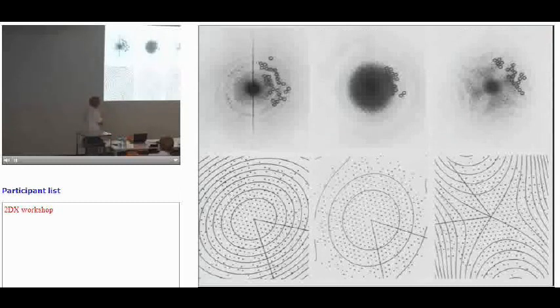These were the first 3 images of purple membrane that we got about 1985. This one was the only image we got from the EMBL. Jean Le Paul had a Zeiss microscope with a Siemens liquid helium lens on it. It was very unstable, and it would go wrong every hour and so on. And we gave up correcting the astigmatism because it was so annoying. So as a result, we have this beautiful image that goes out to 3.5 angstroms, but it happens to be more or less in focus with several thousand angstroms of astigmatism, which is why you get these nice patterns.